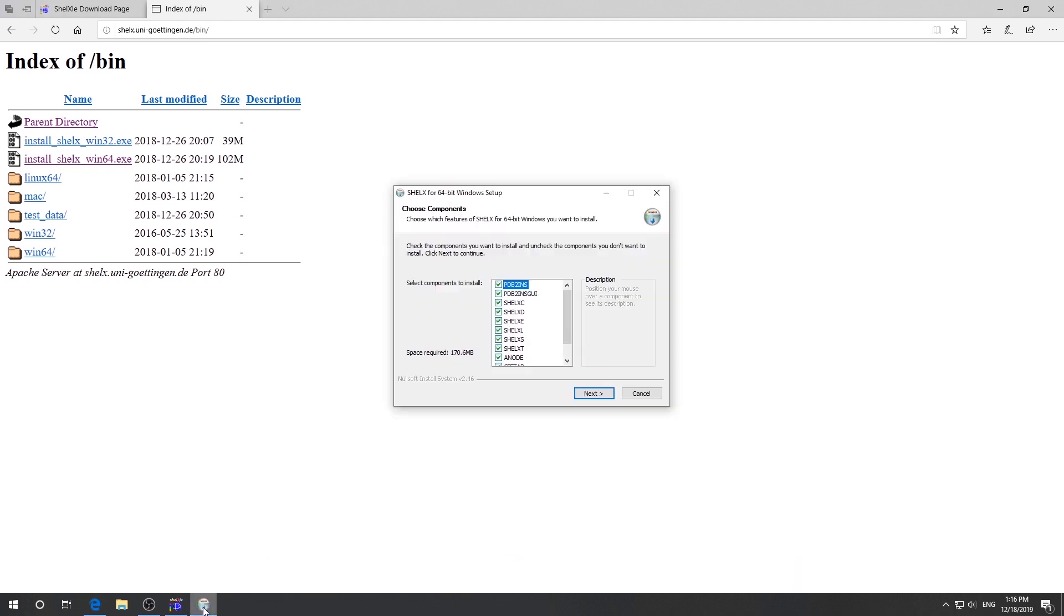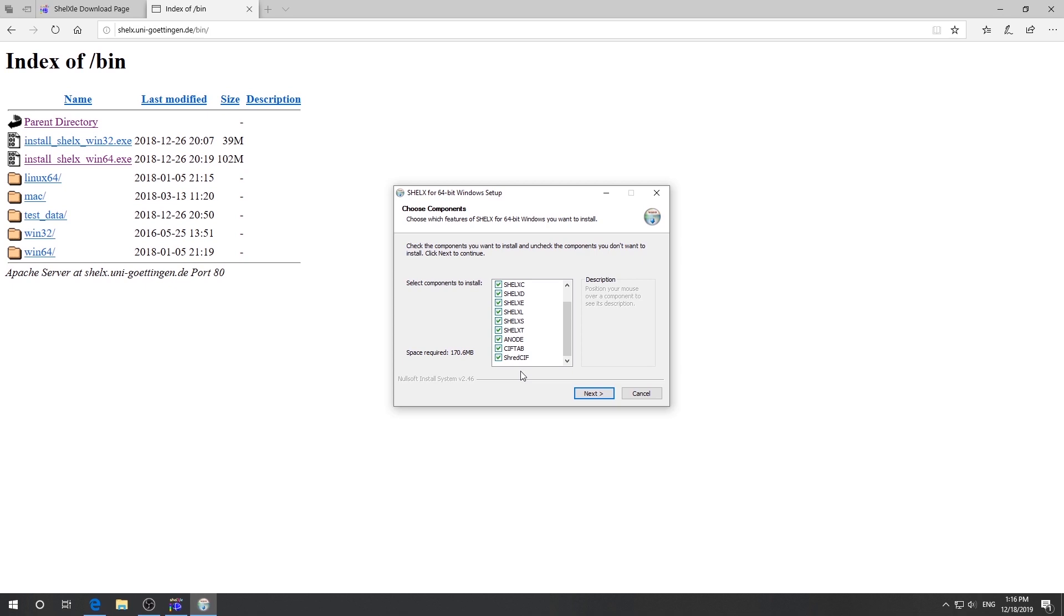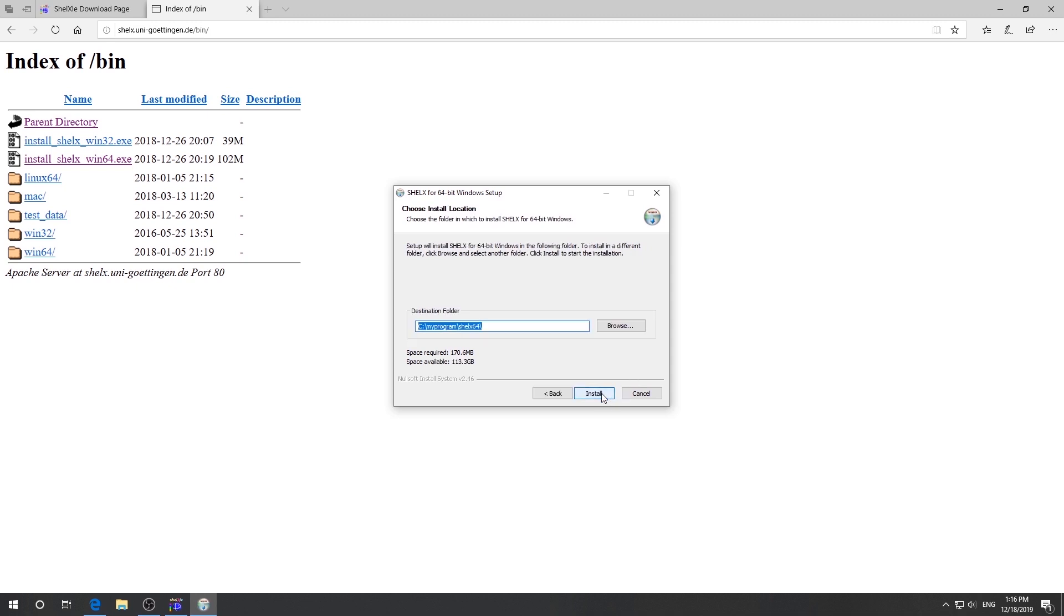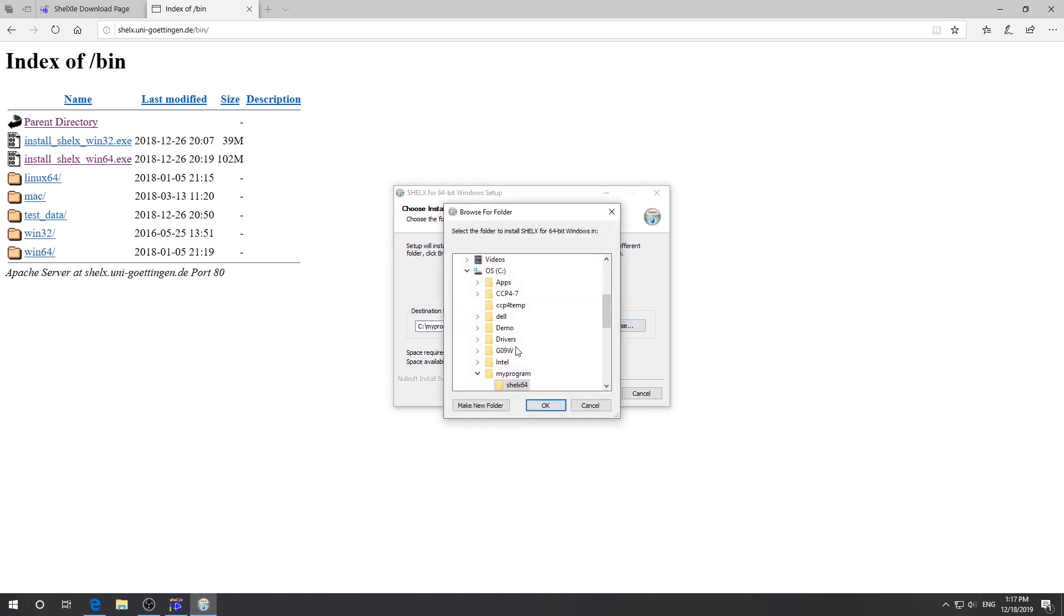Click this icon to make it up front. You can just keep the default setting. Or you can uncheck any program. As long as you know what you are doing. I strongly suggest you keep everything. And they are small anyway. Then click next. Then you choose a location to install. Note you need to remember this location for further settings. So either take a snapshot of the screen or write on a note somewhere. Let me browse to the same location.